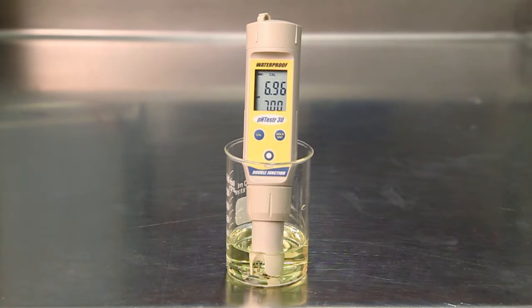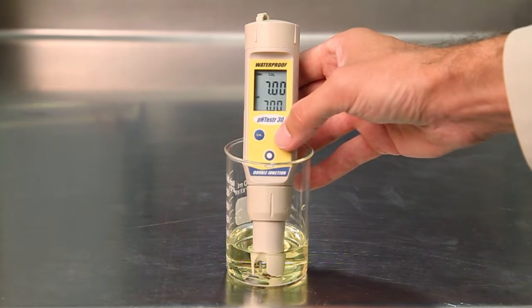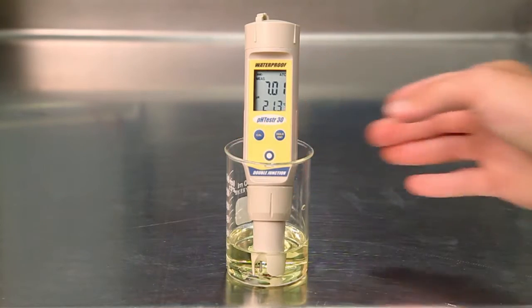To abort calibration, press the cal button. Allow approximately 2 minutes for the reading to stabilize before pressing the hold enter button to confirm the calibration point. The upper display will be calibrated to the current pH buffer standard and the lower display will toggle between readings of the next pH buffer standard. Press cal to exit calibration and enter measurement mode.